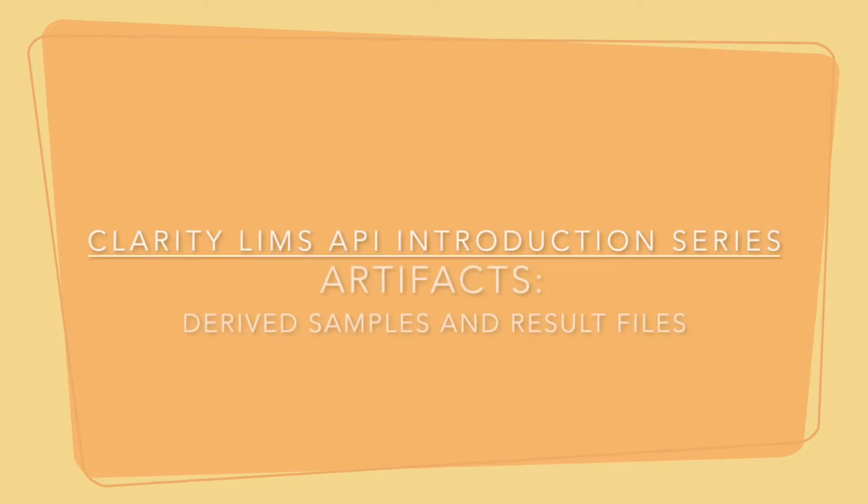In this video, we'll explore artifacts. Artifacts are outputs of steps and are represented at the artifact's endpoint. An artifact cannot be created on its own. It may be created either as the root artifact, which is created during sample accessioning, or otherwise created as the output of a step.